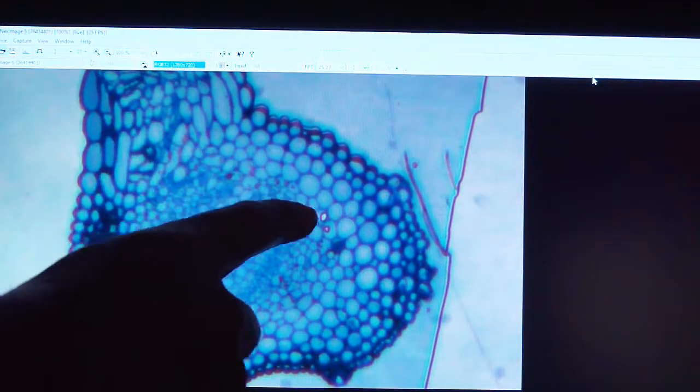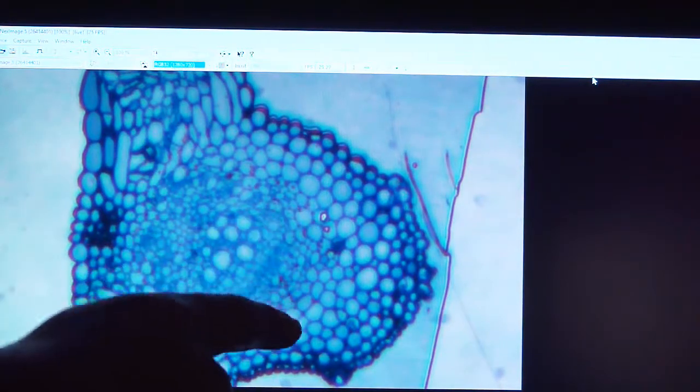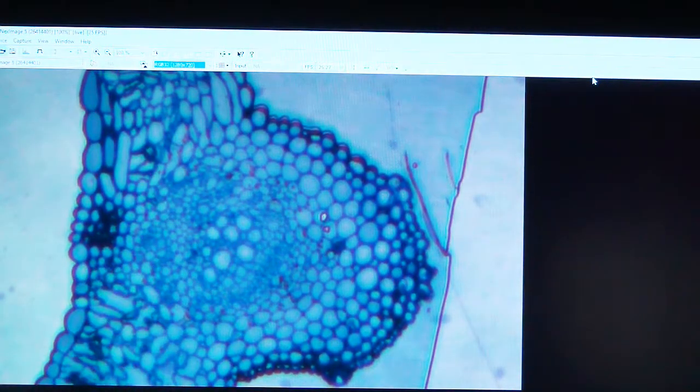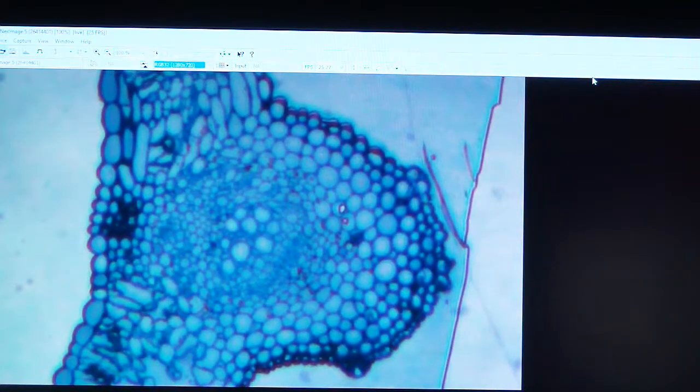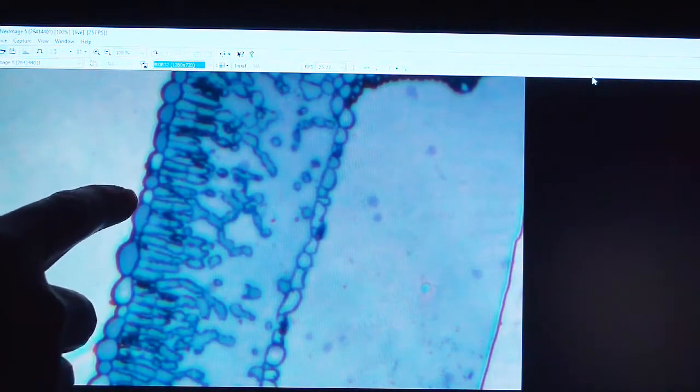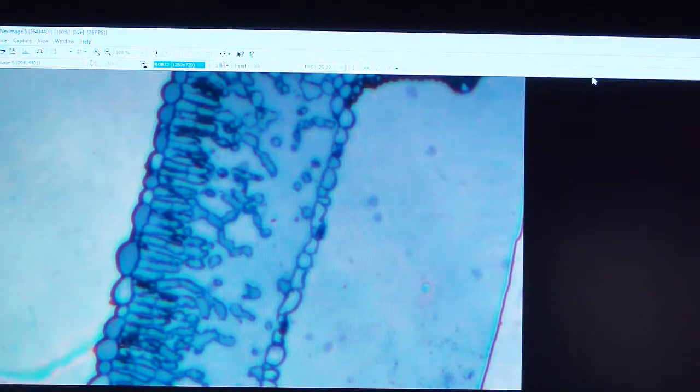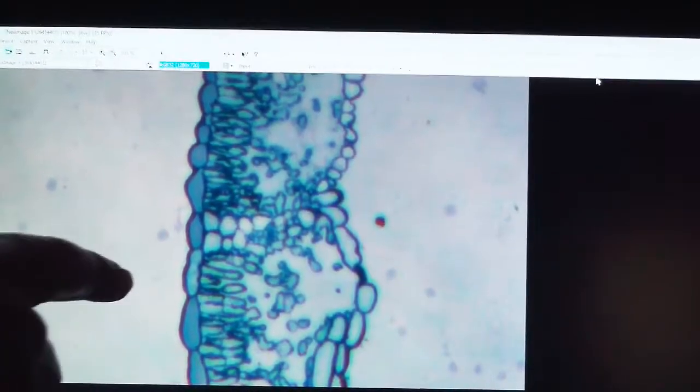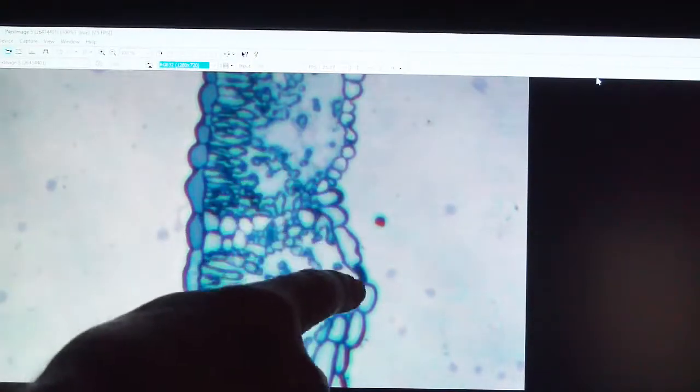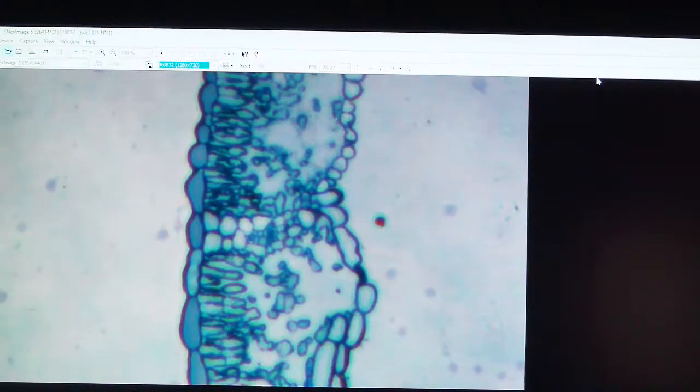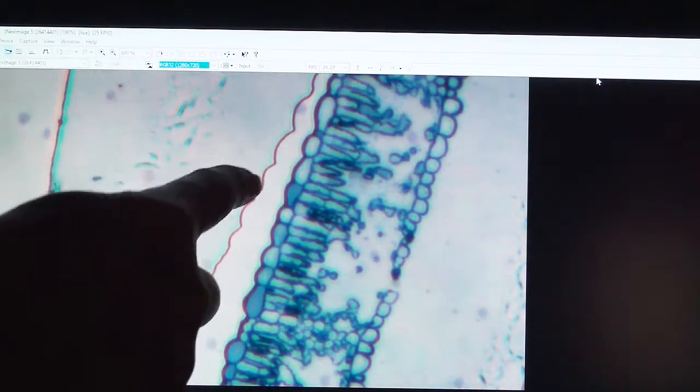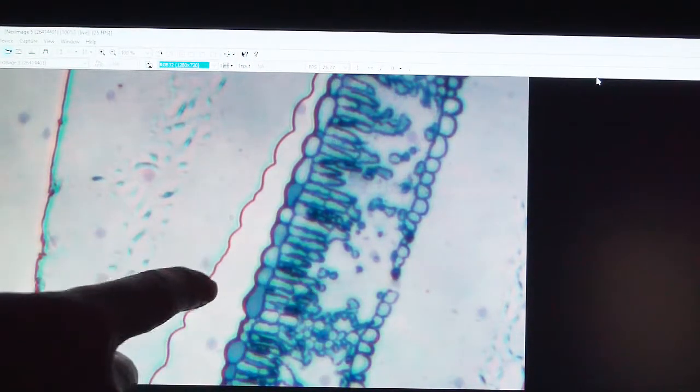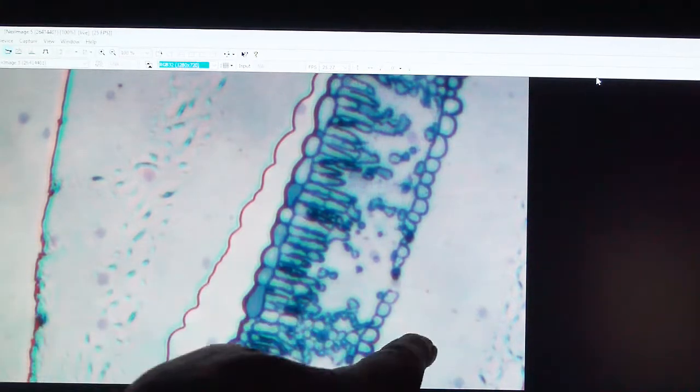Here's the thick section. As I take a look at it, I can see one little void there, but for the most part throughout all of the vascular bundle is all well infiltrated. I don't see any voids anywhere, especially up at the upper epithelium and the lower epithelial areas. If you've sectioned as much plant as I have, you'll recognize that that's usually a very difficult place to get infiltrated. Now I do have a little bit of a delamination, but that's because I got carried away during my trimming job and pushed the resin away, but on the other side it's all intact.